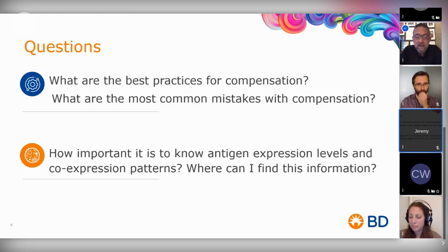Now, in addition to that, there is unpublished work that we have at BD that was done several years ago in a collaboration with Peter Krutzik's company called Primity Bio, now part of Caprion. That database, we have made it available for individuals just by asking at BD, and we're more than happy to provide it for you. It explores approximately 380 CDs.